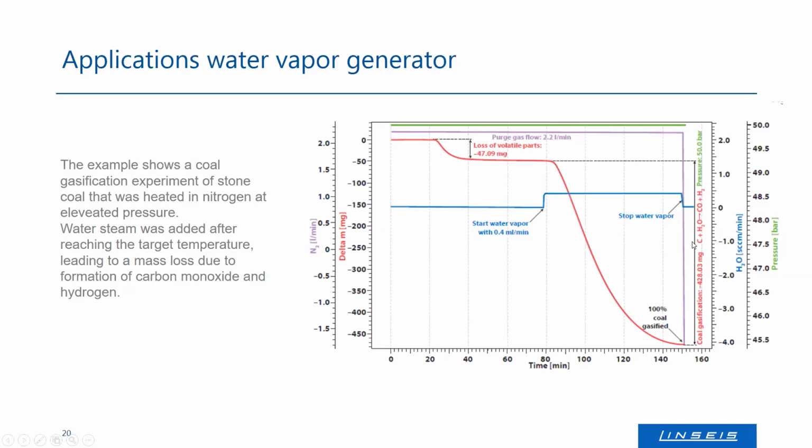People who are doing research are very frequently interested in how much carbon and how much hydrogen content they can get out of their type of sample. And therefore, the setup is always similar. What they do is, so this is a little bit confusing, so I'll explain.